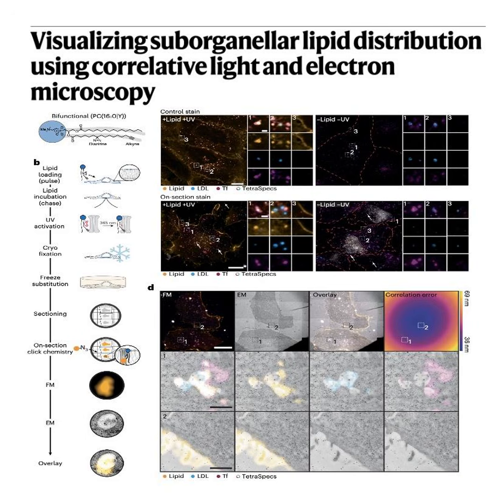Let's walk through those mechanics, starting with L. So L is for load. The bifunctional stealth probes have to be inserted into the outer leaflet of a living cell's plasma membrane. To do this gently, they use an alpha-methyl cyclodextrin-mediated lipid exchange. That is a mouthful, cyclodextrin. Basically, cyclodextrin is just a microscopic molecular shuttle with a hydrophobic pocket. It safely ferries the fat-soluble stealth probe through the watery environment outside the cell and deposits it right into the membrane. And the chase time here is strictly capped at exactly 4 minutes. Got it. So that's load.